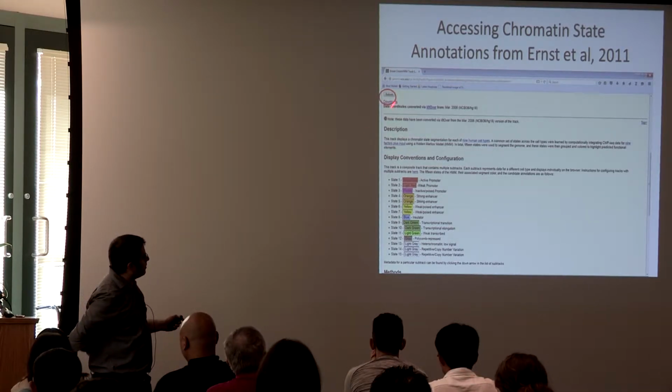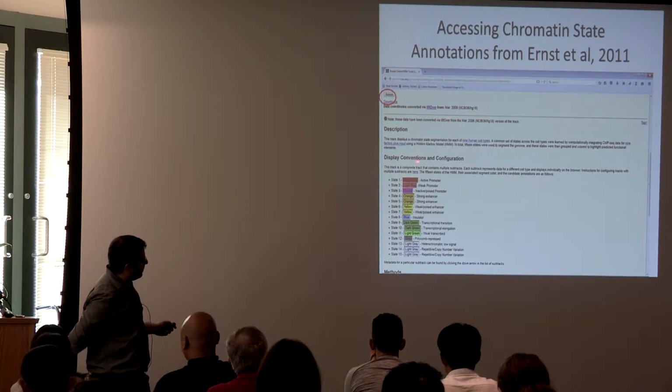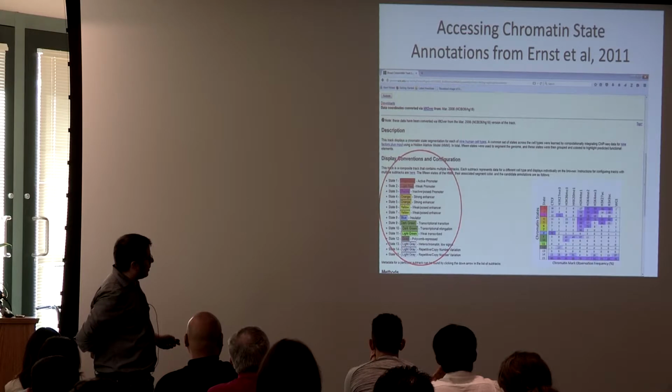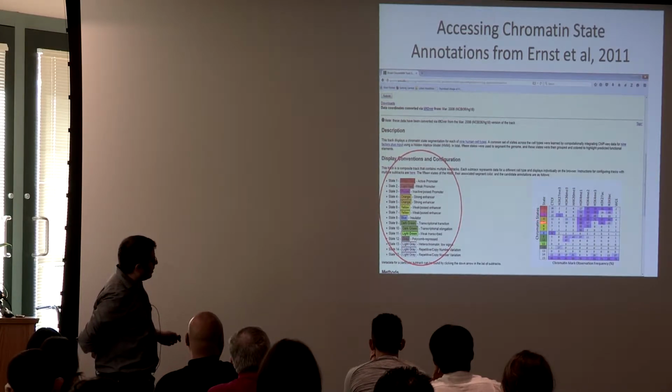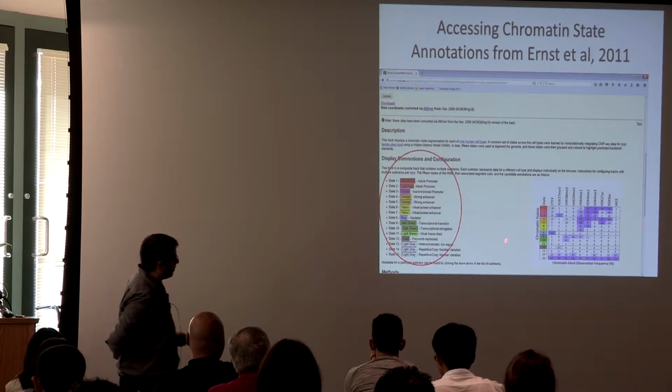And that's generally going to be true for other ways I'm going to access this. And then they have a description of this, and it has our candidate annotations and the coloring scheme right there. And this is showing you, I've just pasted in the emission parameters corresponding to this that I showed you before.